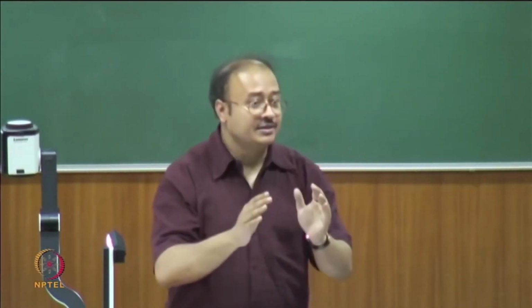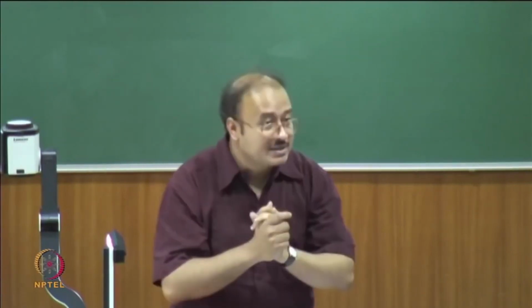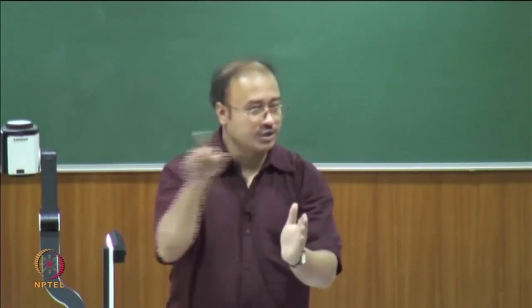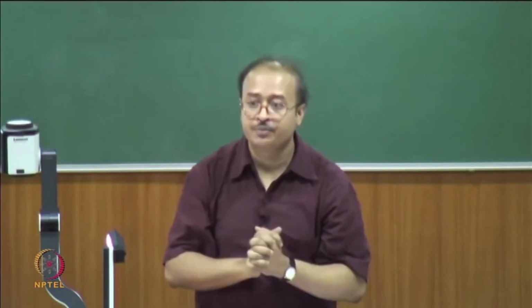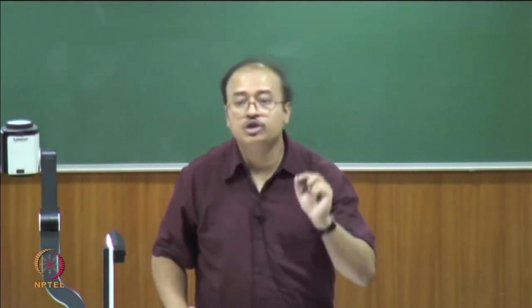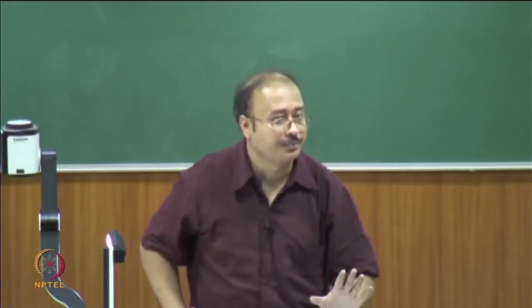Now, the laser light is appearing in pulses, that means like this, it is not a continuous light. You have a laser light, again you have a laser light, again you have a laser light, right. It is called a laser pulse, and this pulse is very small. You have a huge amount of energy being thrown into the sample. Now, do not worry about the actual details of it.